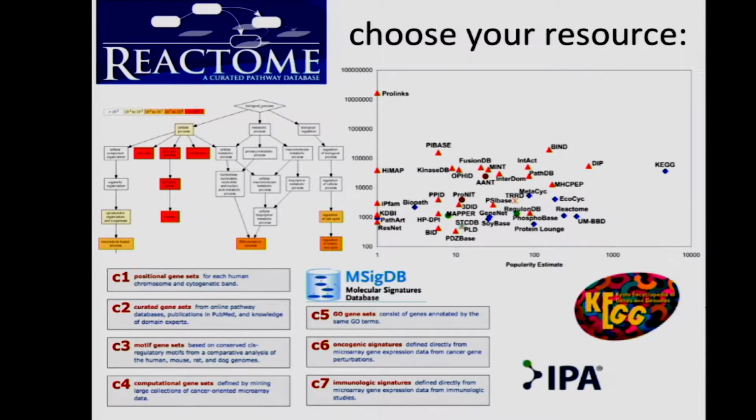Incredibly useful, very popular tools. They've been in the community for a long time and have a lot of take. Reactome, we'll talk about gene ontology. We'll talk about GSEA and the database called MSigDB that GSEA uses. The Ingenuity pathway analysis tool is a commercially available pathway analytics tool, available to academics for a mere $10,000 a year. But your bioinformatics core may have access to it. So that's something to explore.